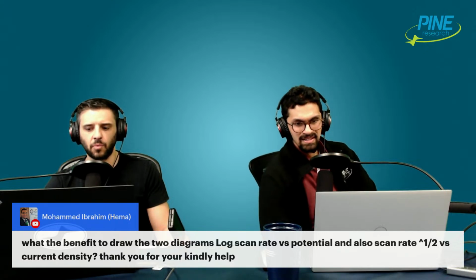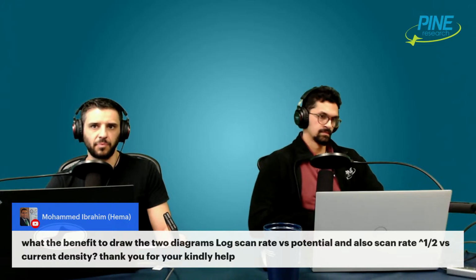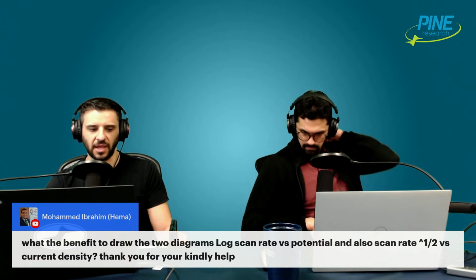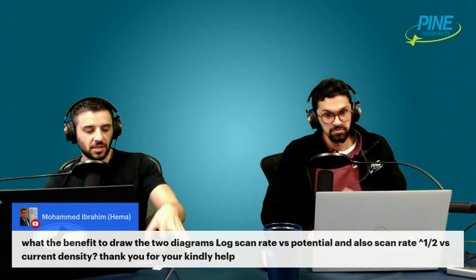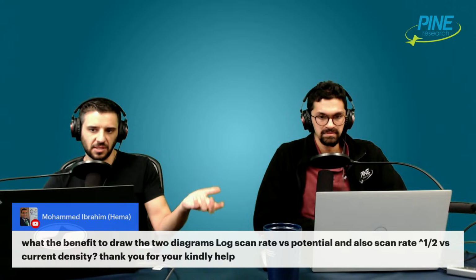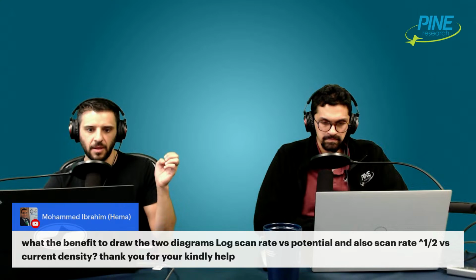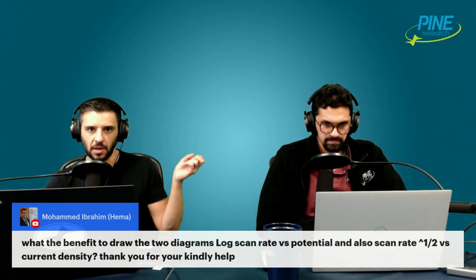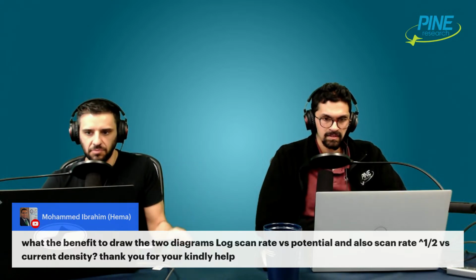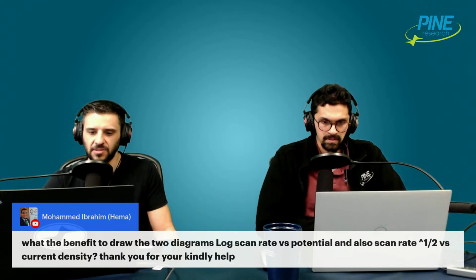One of the ways that would matter is if your scan rate is going from 0.01 volts per second up to multiple volts per second, so you're spanning a huge range, which you probably are. Then plotting it as a log can help space the points out more easily. This is why impedance data is plotted logarithmically, because you're going from 0.01 hertz to 100,000 hertz. It's many decades. You can plot it linearly, it's just terrible to look at. So that's one of the reasons.